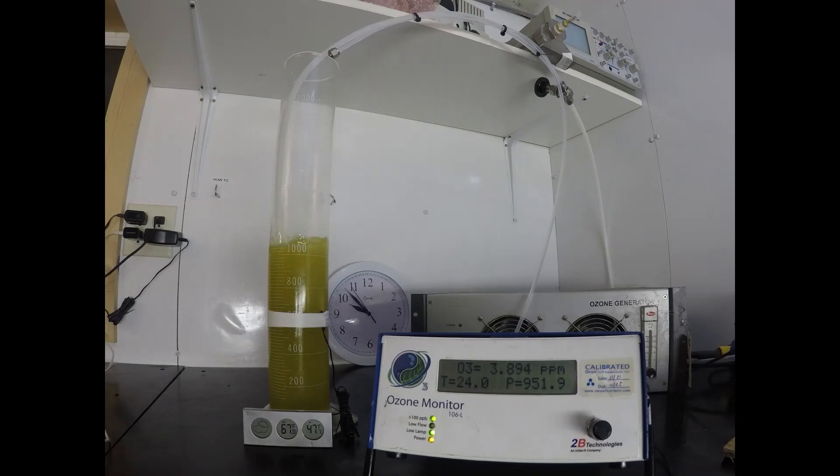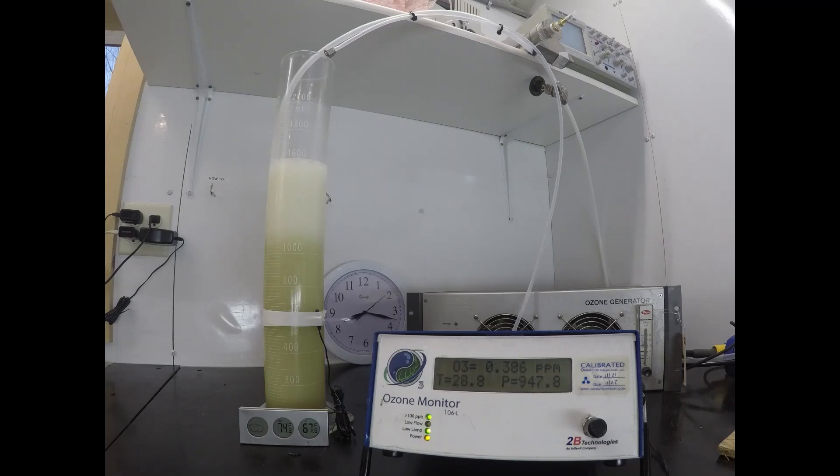We're measuring the ozone at the headspace with a UV-106M ozone analyzer, which is pulling a sample of gas at the headspace of that reactor — you can see the little tubing there. At the bottom you can see a temperature gauge. The room temperature is 80 degrees Fahrenheit, and we've got a little temperature probe tied to the side reading about 70 to 75 degrees Fahrenheit. You'll see that change as the process goes on.